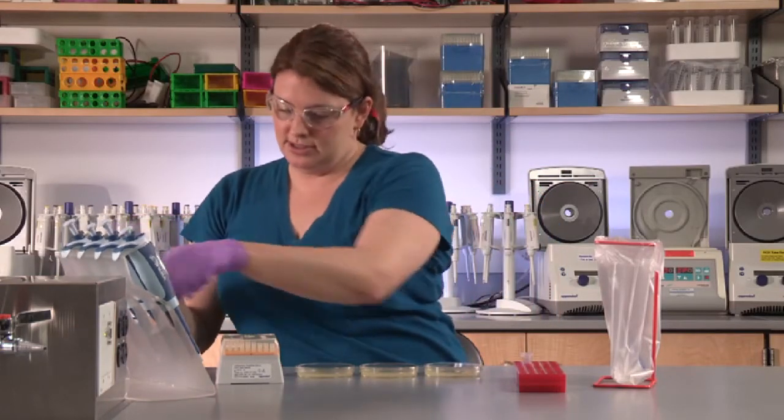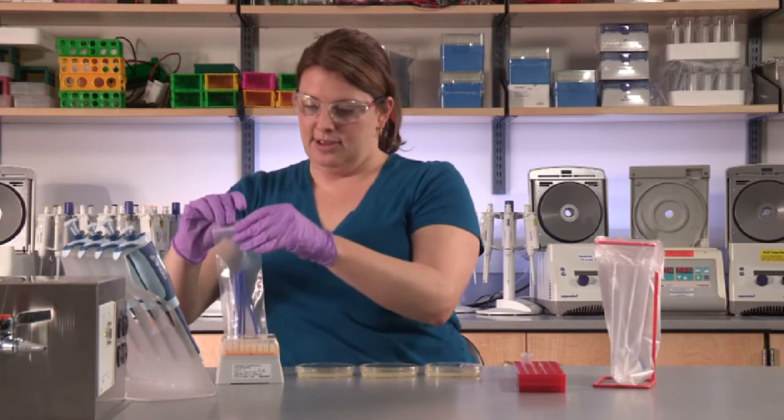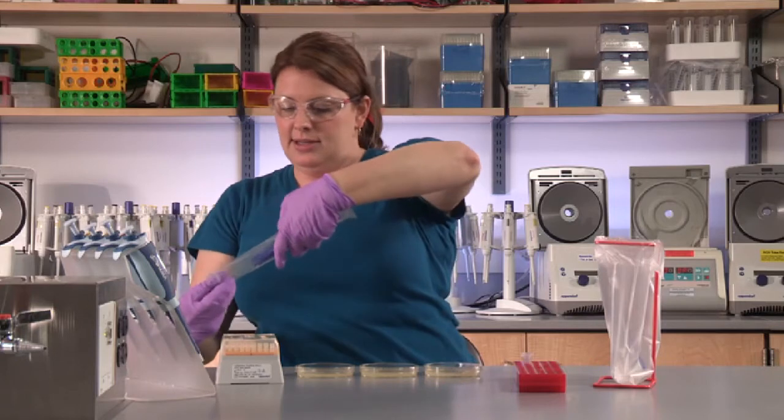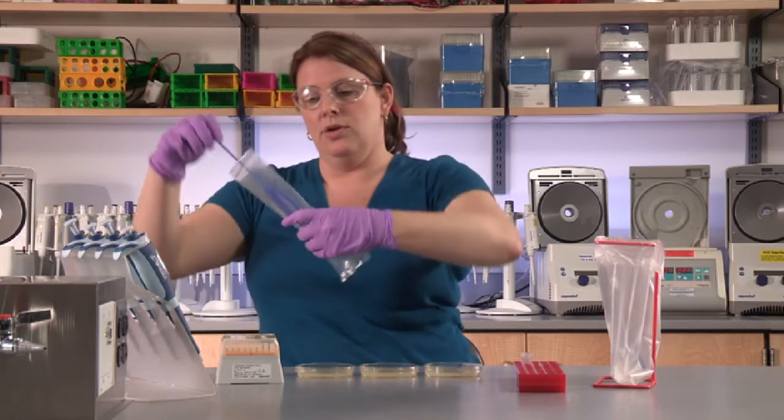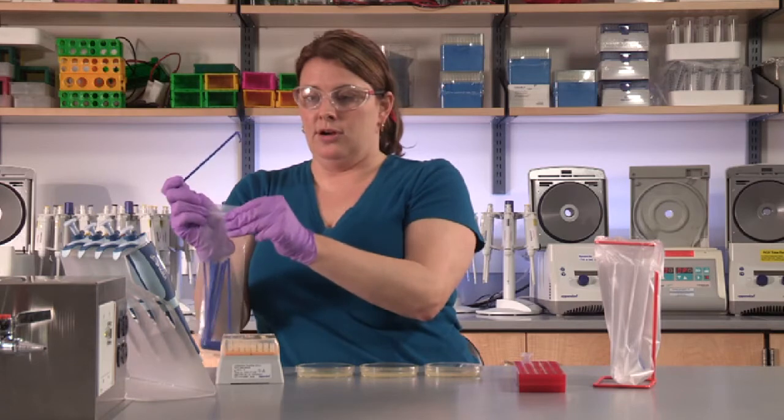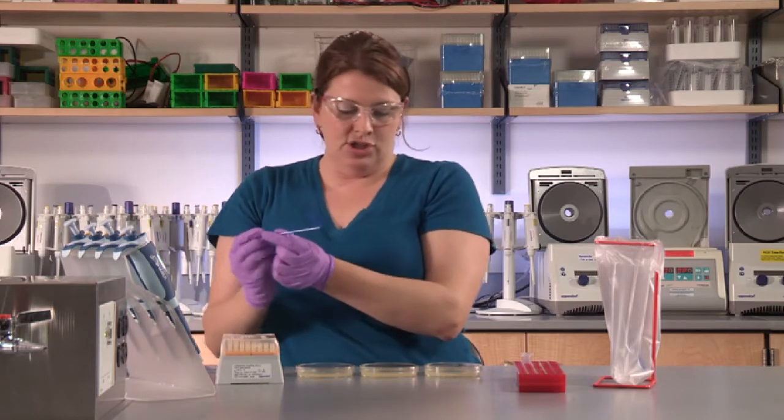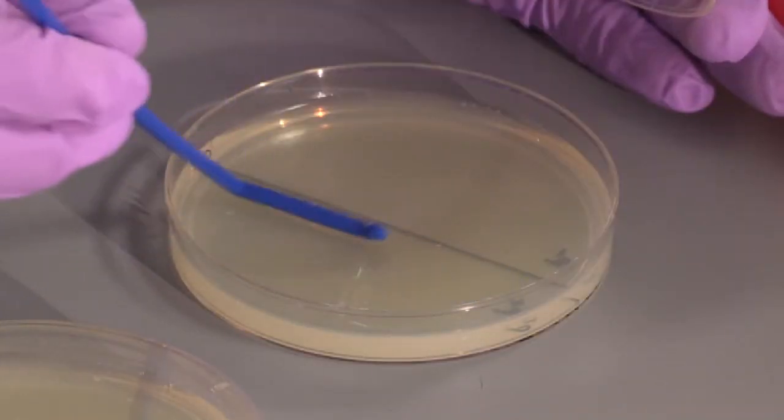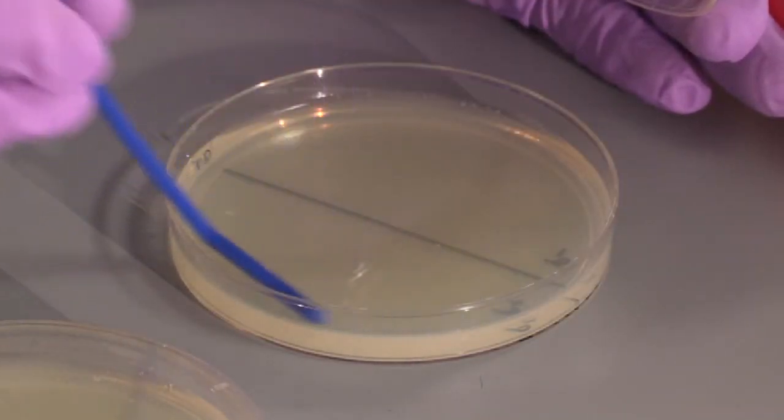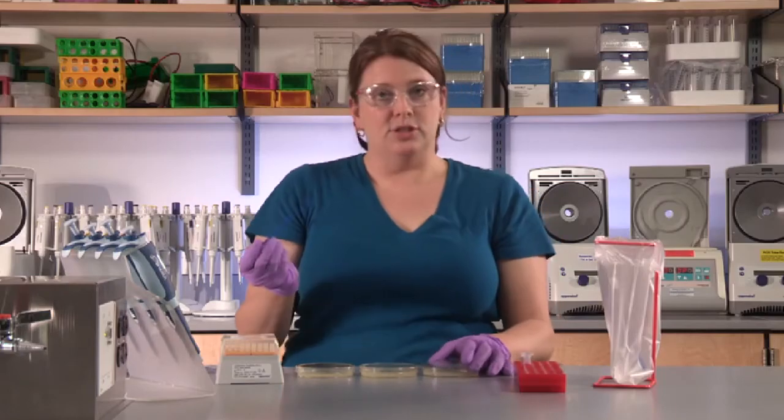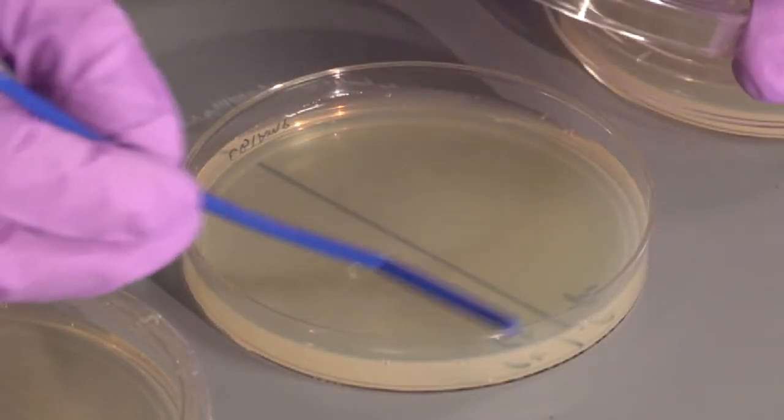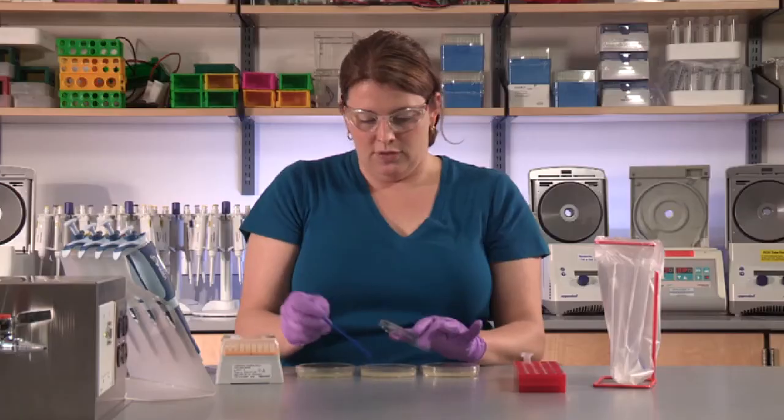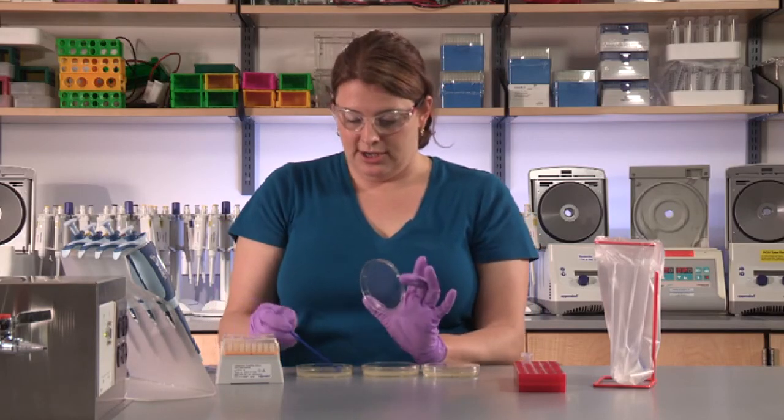Now you're ready to spread these cells. Again, carefully open the packet which contains the spreaders. Remove a fresh one, avoiding contact with your hands and the bench. Go along the plates and spread the P+ that you've just plated. Use a gentle motion back and forth, going over the surface of the plate and trying not to gouge it.